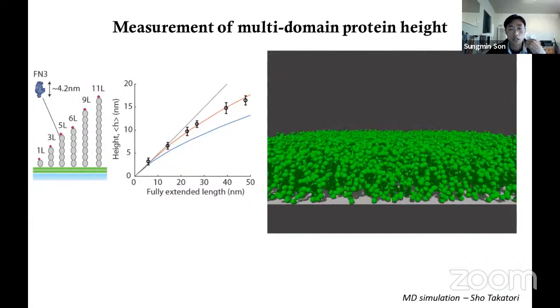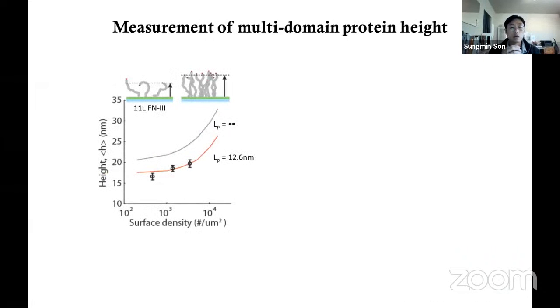So we wanted to see if these crowding pressures have an effect on the size of the total protein height. That's what I tried to recapitulate here. Increasing the binding concentration of those proteins on the surface, I start to see that the average protein height I measure actually starts to increase. But there was a limit to how many of these proteins I can add on the surface.